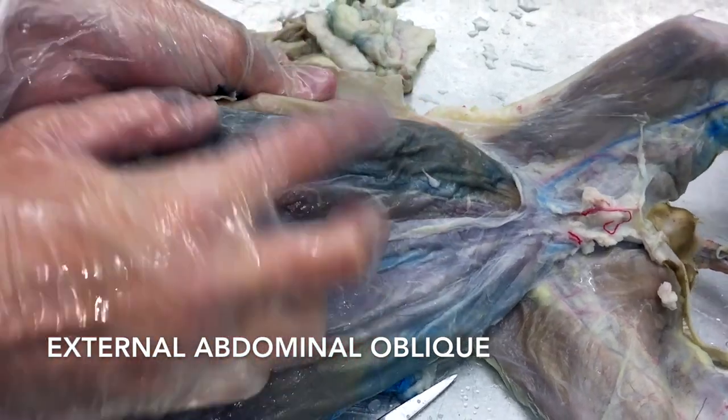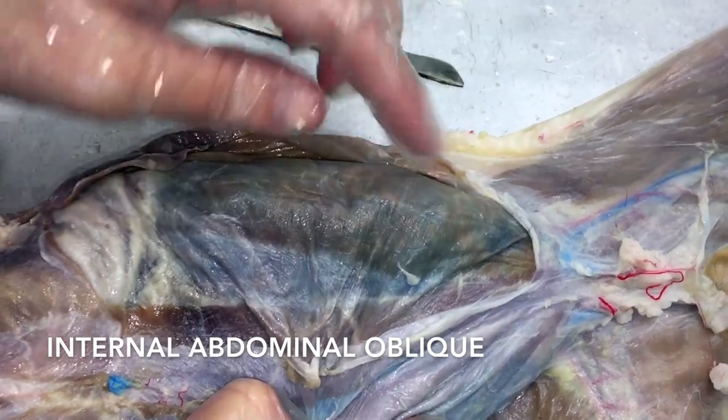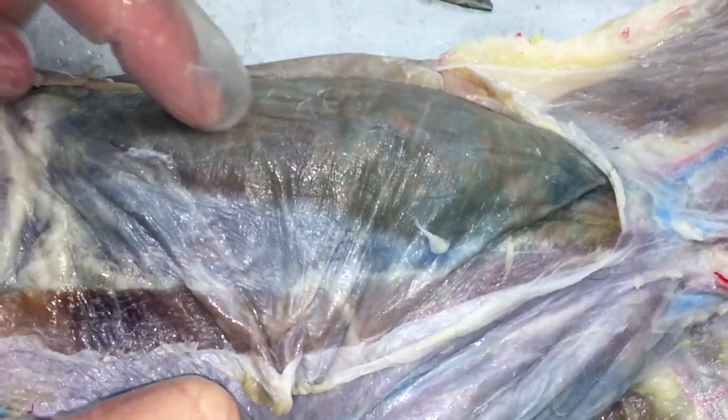If you peel that out of the way and look underneath, you can see there's a muscle right here. The fibers go this direction — this is going to be your internal obliques. You can actually see the little stripes. Internal obliques are here.